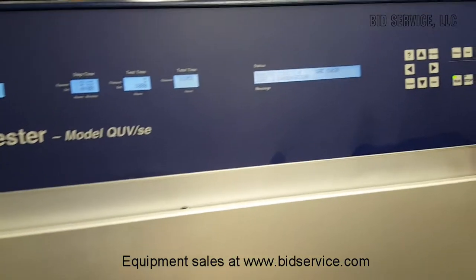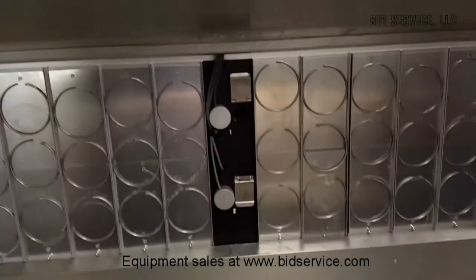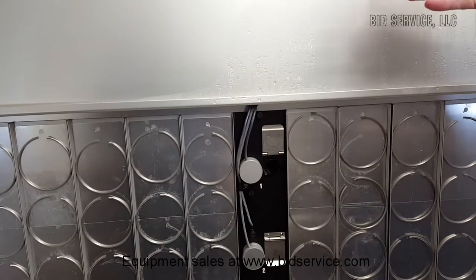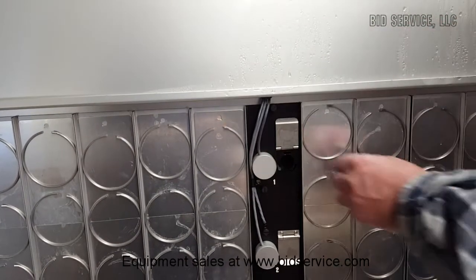We're in the run mode now. On each side, the other side has exactly the same configuration. We can open up this panel, and as you can see, I'm in condensation mode and we have condensation appearing on the panels.